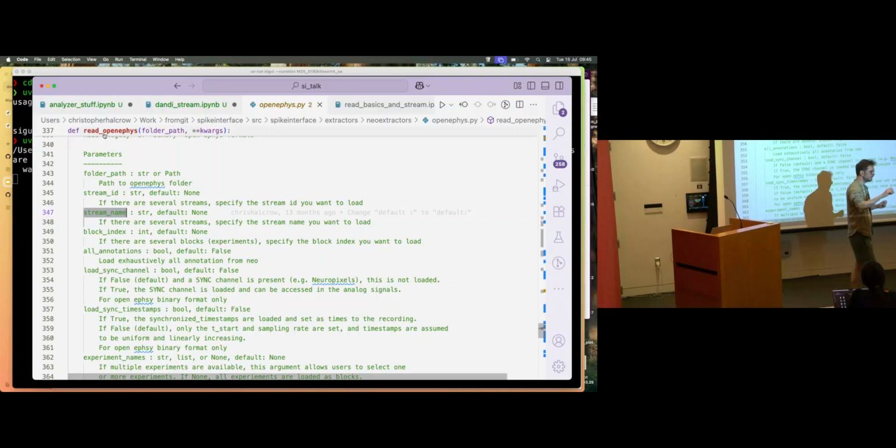The alternative is to sort each session independently and then try to do unit matching afterwards. And UnitMatch is pretty good for doing that, but there's not really been a study to say which one is better. In my experience, it gave pretty similar results, actually, but that was looking at sessions that were on the same day, but an hour apart. And that was also chronic, which will change things. But yeah, there's those two workflows. I don't know what to recommend, but they're both very easy to implement in SpikeInterface.